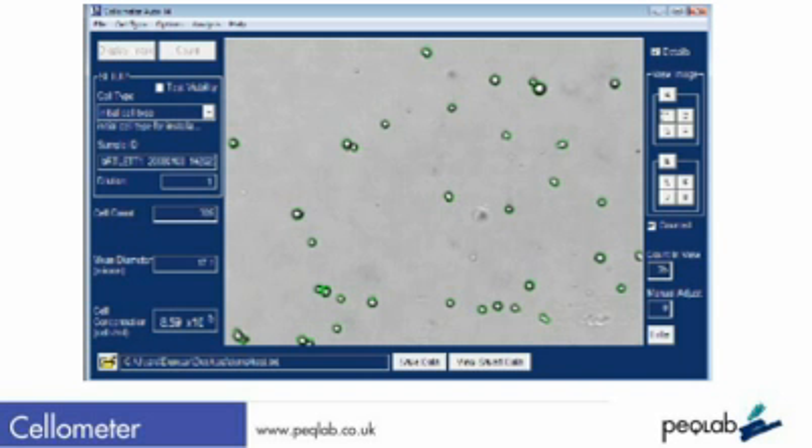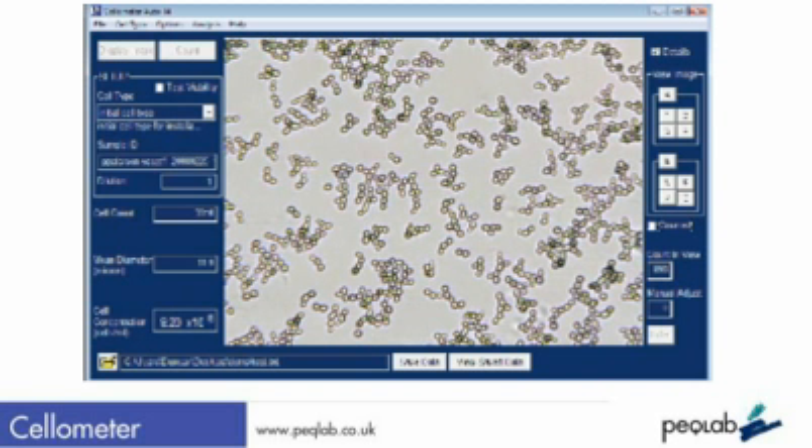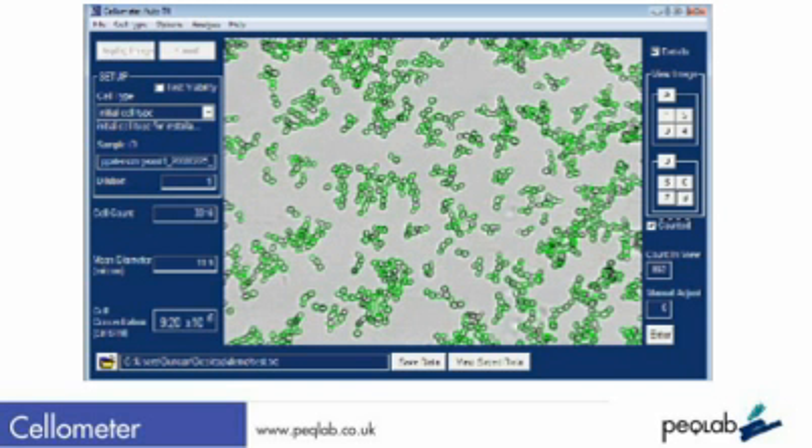Here we see, quite correctly, the system has split cell clumps and also ignored cell debris. On more complex samples, like this concentrated yeast sample, the system still works very effectively to split complicated clumps.